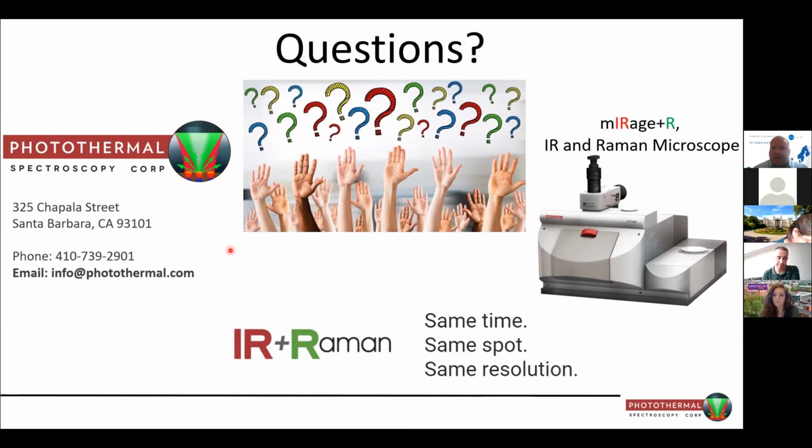Excellent. We have another question as well, just checking that person got it correctly. So there is an IR amplitude modulation of the visible light via the sample, and the gain in spatial resolution is through the smaller visible interaction volume and high spatial IR absorbance within the sample. If so, the resolution should still be dependent on the IR absorbance, right?